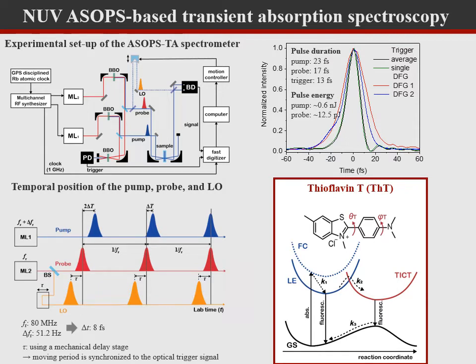When ThT molecules are dissolved in solvents containing chlorine atoms, chloroform and dichloromethane, the fluorescence quantum yields become notably high compared to those in non-chlorinated solvents such as methanol, even though the viscosity of chloroform is similar to that of methanol. In this respect, we measure the frequency-resolved TA of ThT molecules in alcohol and chlorinated solvents.